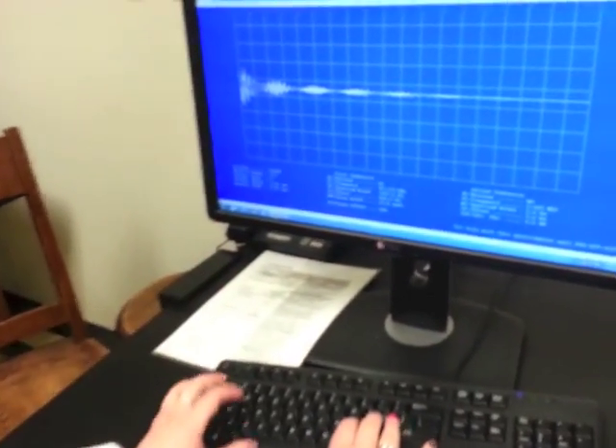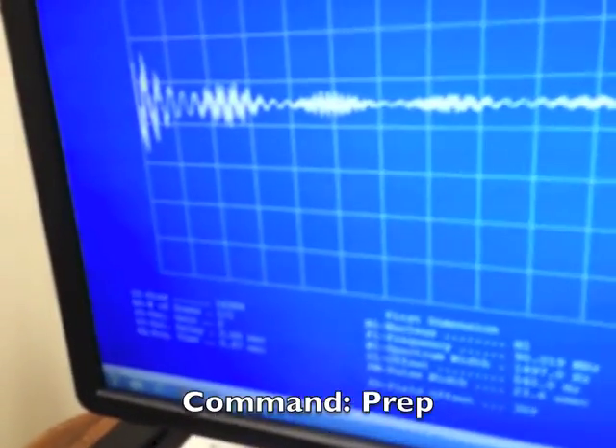In the computer, you're going to type down here and type PREP, and hit enter.